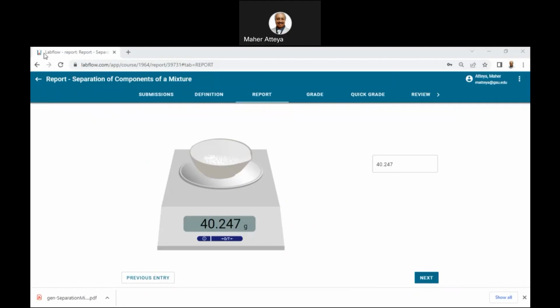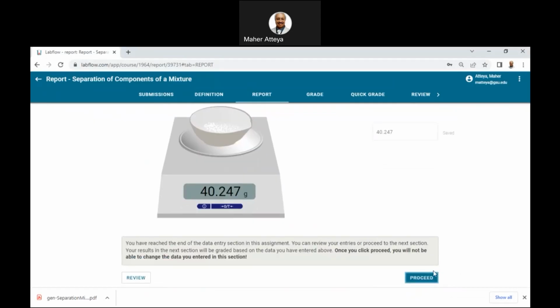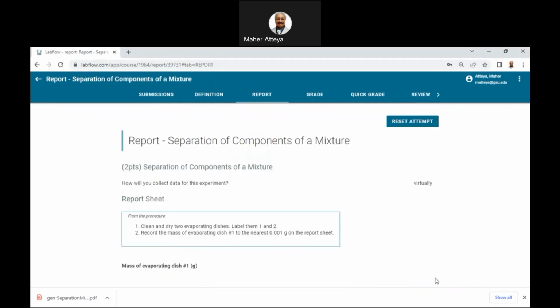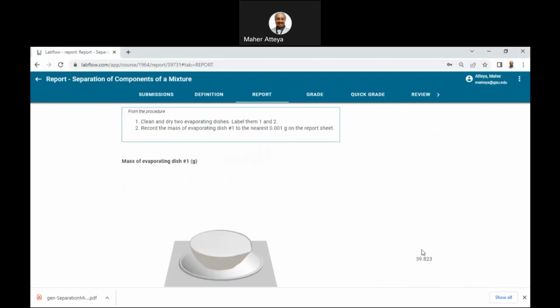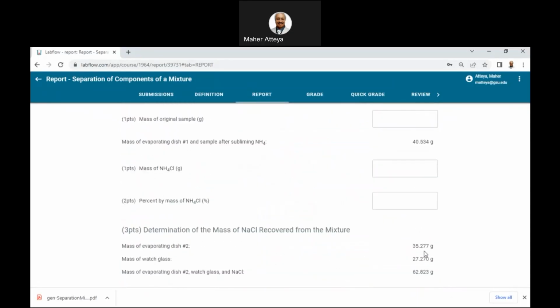If we go look at the top of this here, is it here somewhere? 247, 247. Okay, so now we have to calculate.